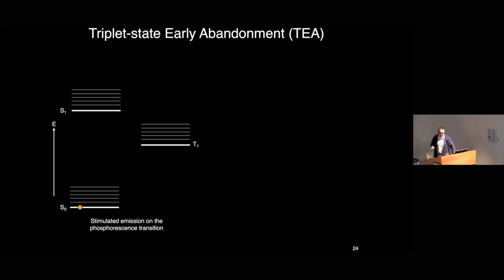reacting with anything. In order to test this out, we want to use a dye that produces a lot of triplets, and we know that halogenated dyes such as erythrosin B are very good at making triplets and also have large intersystem crossing rates, so we should be able to see a good signal there. This is also a nice dye to pick because you can actually see the phosphorescence. Normally phosphorescence is so weak that it's quite hard to detect, but this makes loads of it, so we know exactly what the spectral character is.